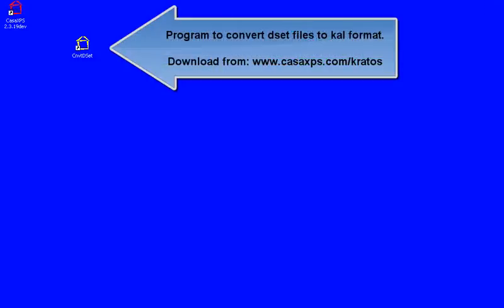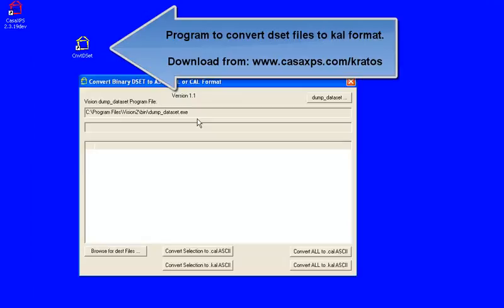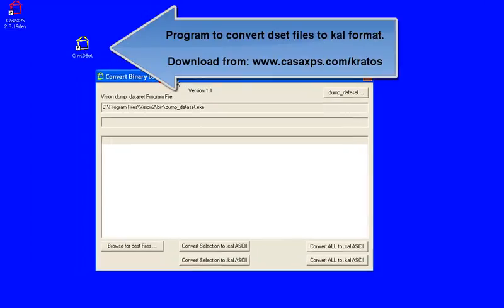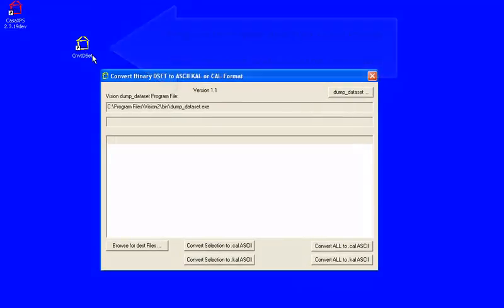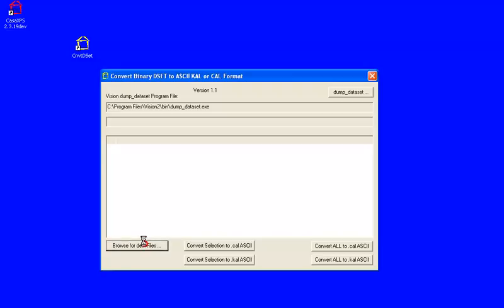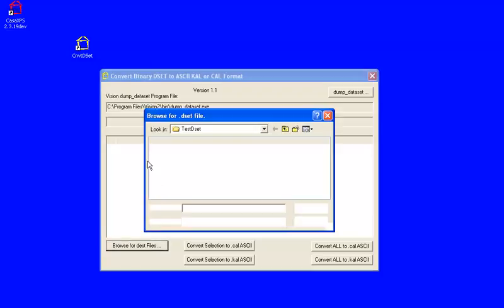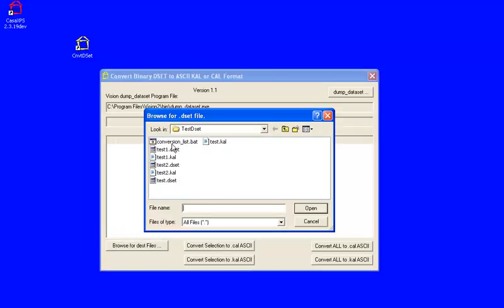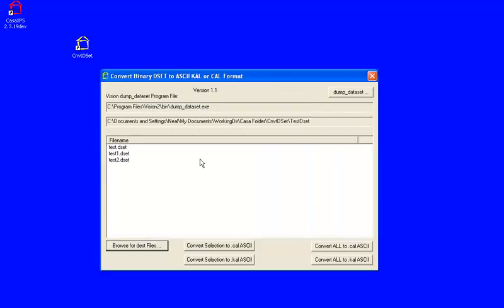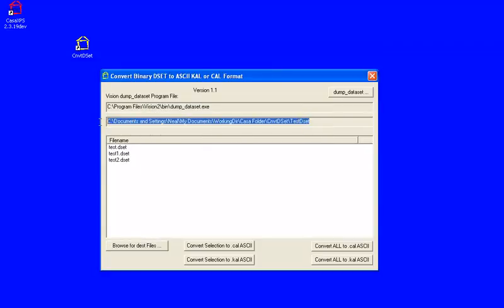To convert a DSET file to a CAL file, what you need to use is this utility program that's available on the CASA website. What you do is browse for the directory that contains DSET files, and when you select one of these DSET files, it then defines the directory and lists the DSET files that are in that directory.